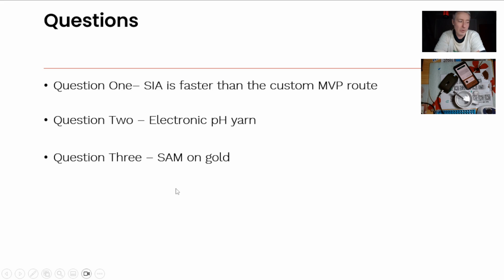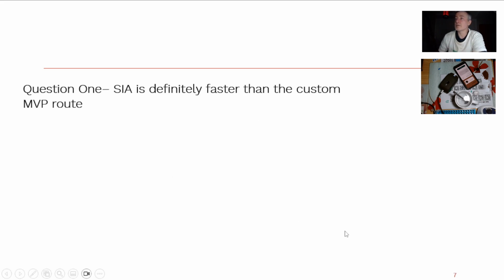I am going to talk about self-assembled monolayers and gold. We do support academics through the use of our sensors. We do ask that people actually purchase our screen printed electrodes and our Sense It All potentiostats, because that's really what funds our capability of giving out all this free material on the channel. I will talk about self-assembled monolayers on gold, and I'll also, though this is not a great answer, since this person's been very kind and asking questions that stimulated some thoughts in my own head, give you some thoughts. It's not the greatest answer I've ever given, and I will touch on enzyme sensors at the end.